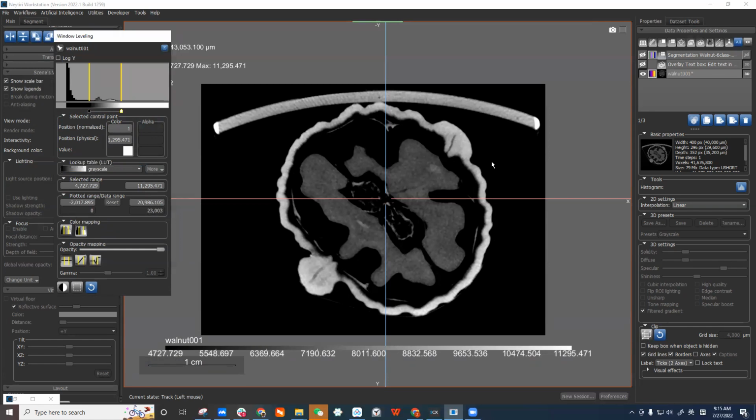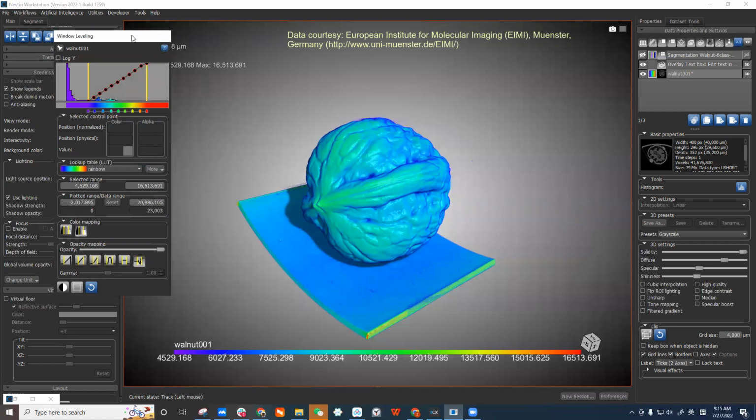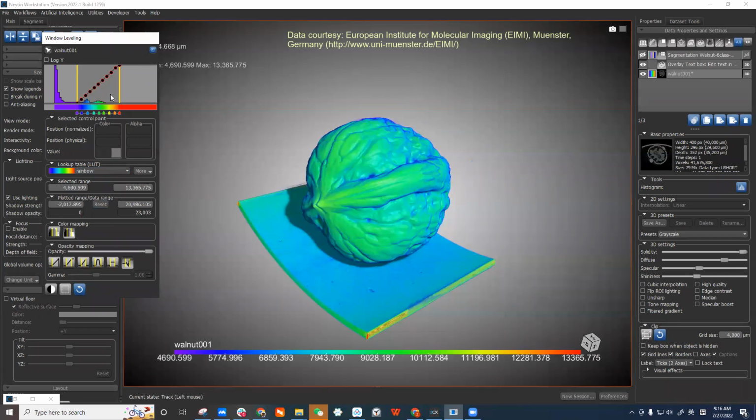And it's the same concept for the 3D lookup table. Let's say it again, the range for 3D is almost the same. The range, the lookup table, the opacity, three elements. For the range, there is some slight difference for the default settings. The default setting for 3D is, for example, this mode.